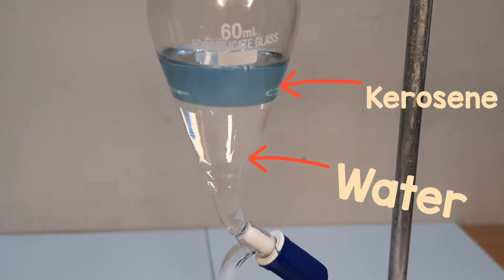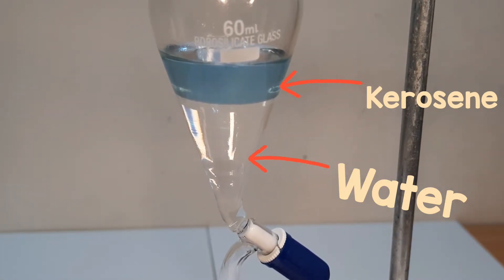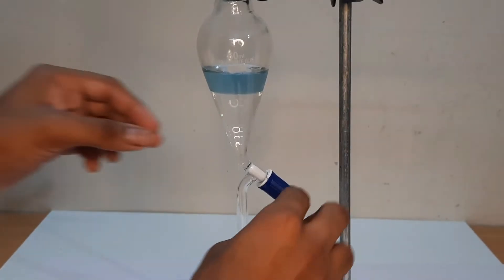Water being heavier forms the lower layer in the separating funnel, whereas kerosene being lighter forms the upper layer.